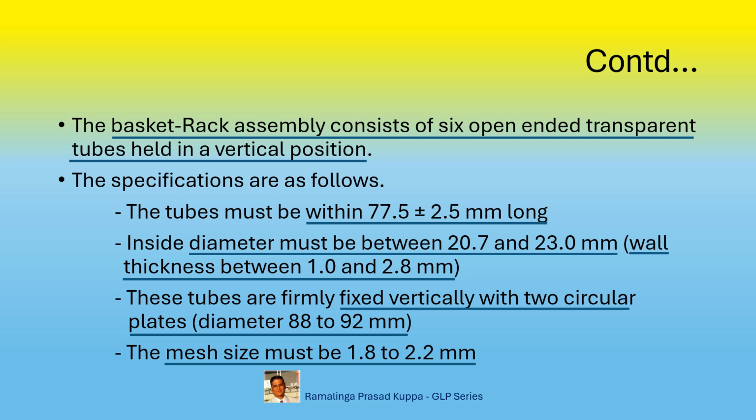It is important to know these requirements. You don't have to do all these checks every time you carry out the test, once you check whether or not the apparatus complies with these parameters. Let us see the specifications for the disc.